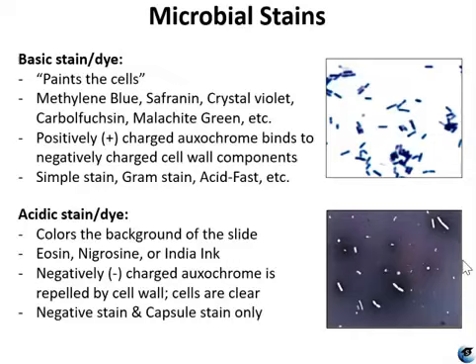Basic dyes are used in most of our staining techniques. So your simple stains use them, Gram stains, acid-fast, endospores, and even flagellar stains use basic dyes.